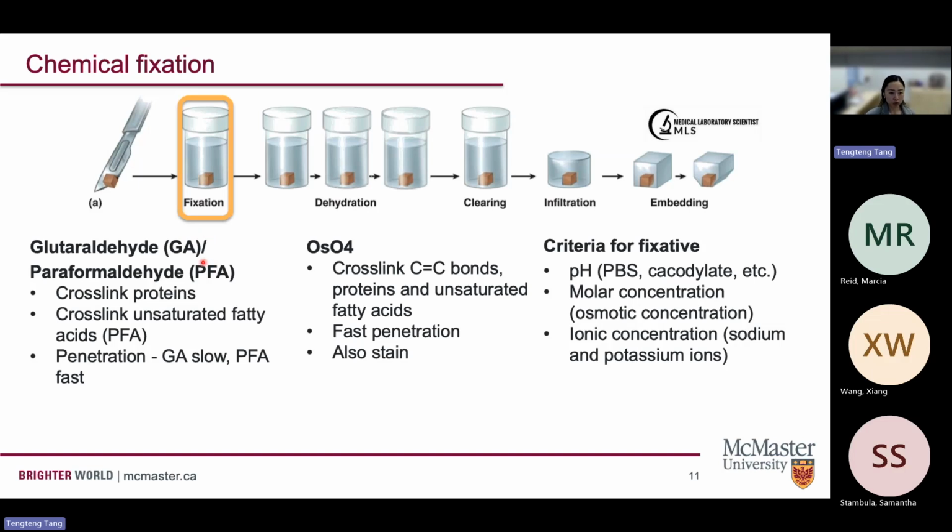stabilize the tissue structure. For example, here we typically use glutaraldehyde and paraformaldehyde to cross-link the proteins, and specifically the collagen in the bone tissue, to stabilize the structure in general. Sometimes we might also use osmium tetroxide, which not only stabilizes the cell membrane, the carbon-carbon double bonds in the cell membrane, but can also stain the cell membrane to increase the contrast under the electron microscope.